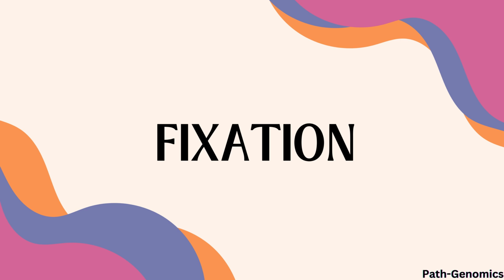Today, we're diving into one of the most crucial steps in histopathology, fixation. We'll cover what fixation is, why it's essential, the different types of fixatives, and some pro tips to get the best results in your lab. So stick around, and let's get started.